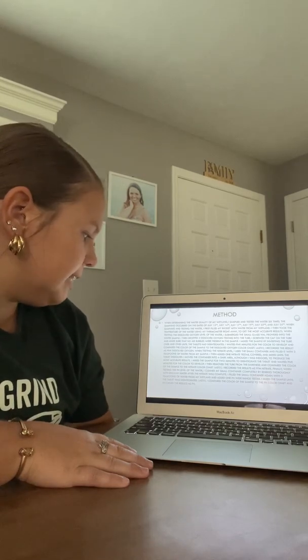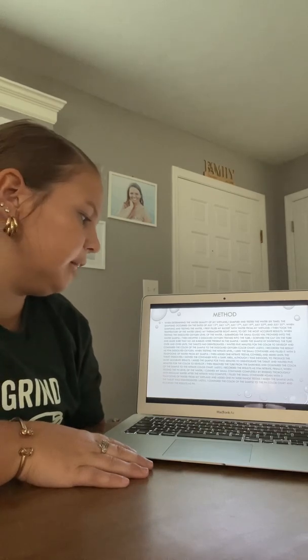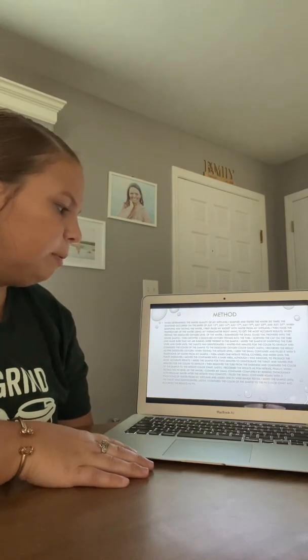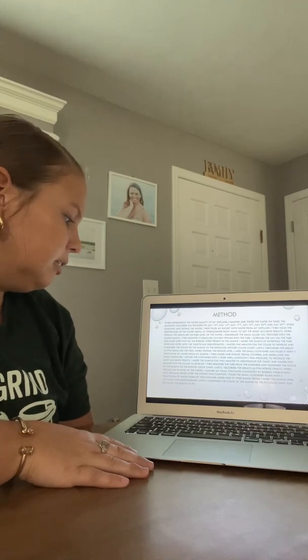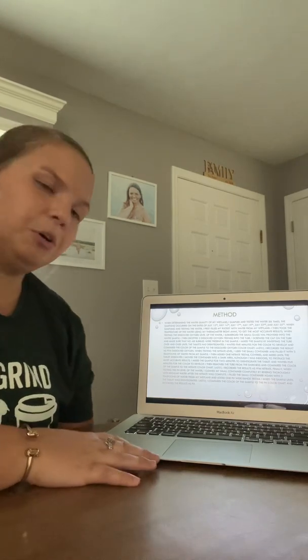Finally, when testing the pH level of the water, I cleaned my small container completely by rinsing thoroughly with regular water after the nitrate was complete. I filled the small container again with 2 teaspoons of water from my wetland and added 1 pH wide range test tab. I mixed the sample until the tablet was disintegrated, and lastly, I compared the color of the sample to the pH color chart and recorded the results as the pH.